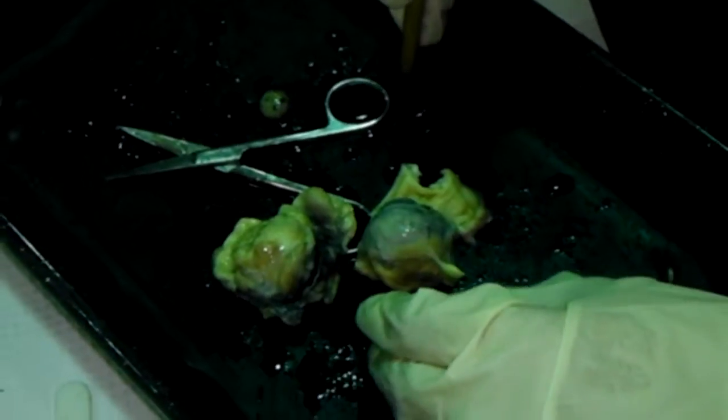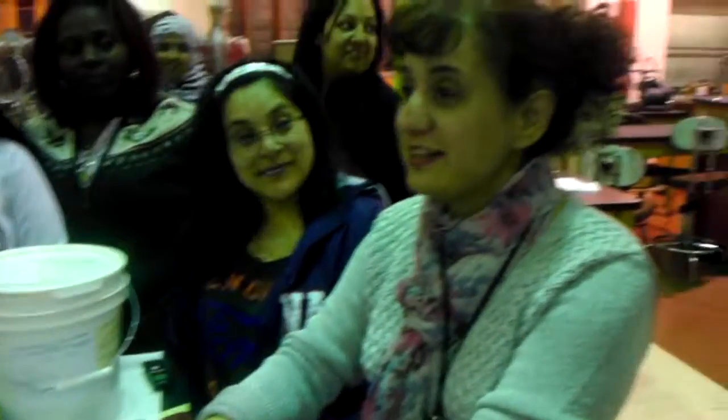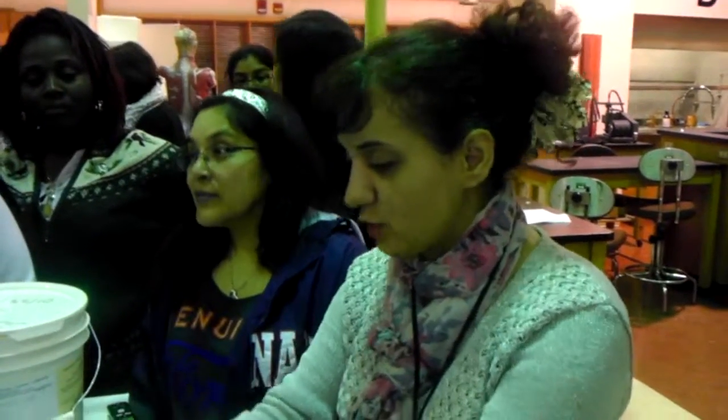On the test, are you going to break it up like this? Both. I may put the entire eyeball to ask you about the cornea or sclera, or I may dissect it to ask you about the choroid, retina, optic disc, pupil, iris, ciliary muscles. So guys, yes, please do the dissection. Make sure in your handout that you have the parts that you are responsible for. Make sure that you can find them. And also look at the picture in your lab manual. It's very beautiful. It gives you all the structures.